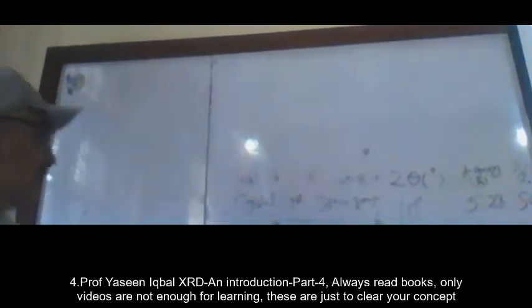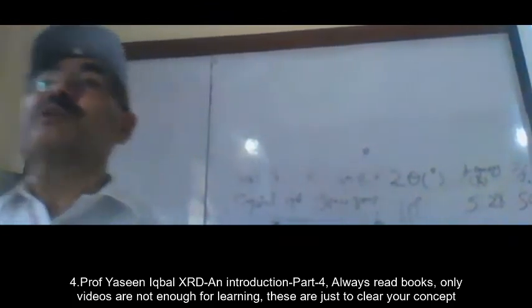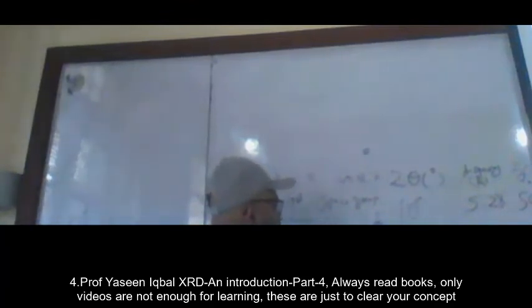If you look at these in the transmission electron microscope, these are the R spacings: R1, R2, R3, R3, R2, R1 are reciprocal lattice spacings. When you take the image from the electron microscope, you take a vernier caliper or screw gauge or any micrometer to measure these distances. So what did you do?